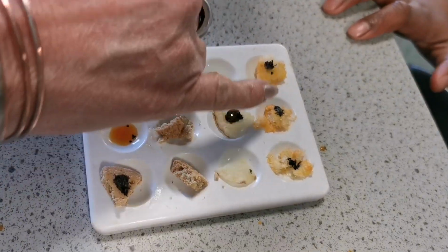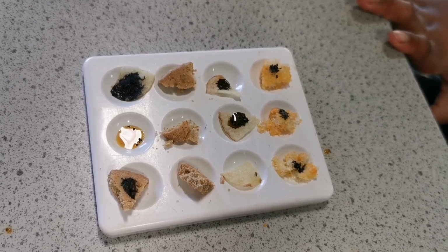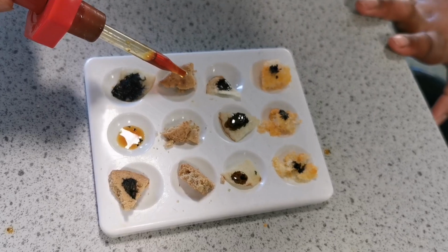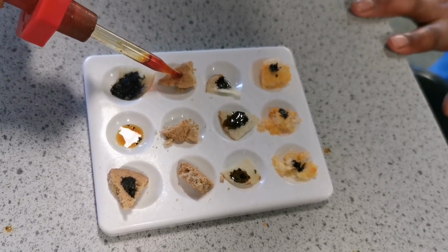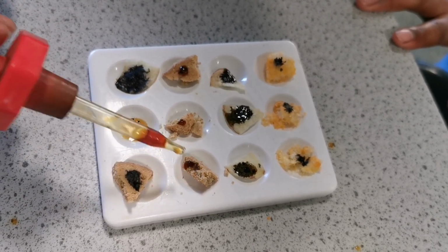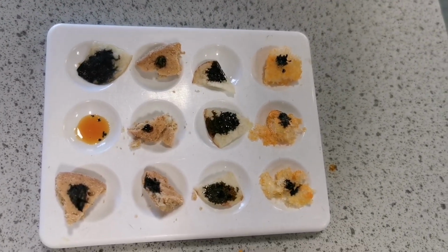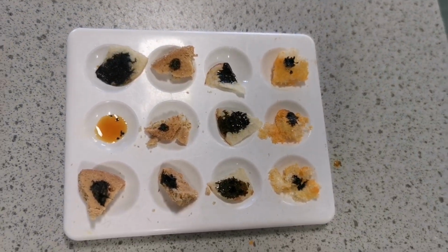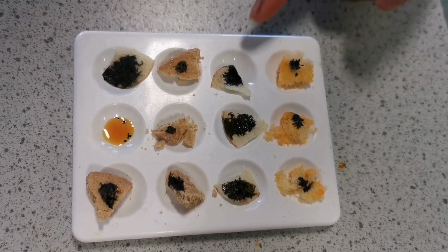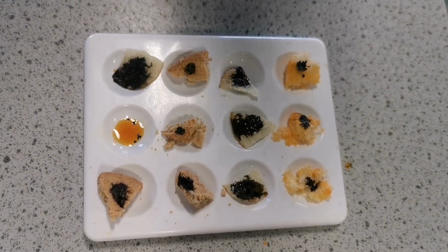So far, what are we thinking? So that's all the crisps done. Now we're going to test the biscuit. It's taking longer to soak in, so maybe we could have crushed it up. Maybe we should have done the same on all of them. Wotsits certainly reacted the quickest, didn't it? However, if we look, there is a positive result on all of them, and potentially the crisps. Nice. Well done, boys.